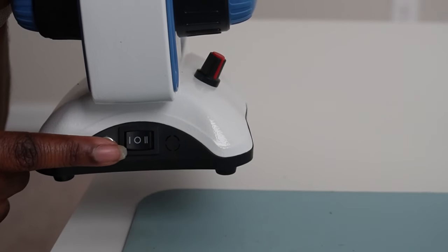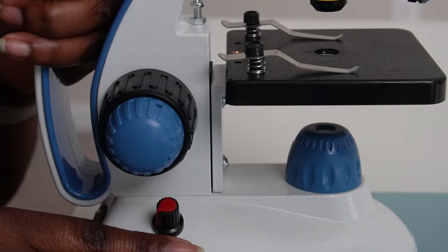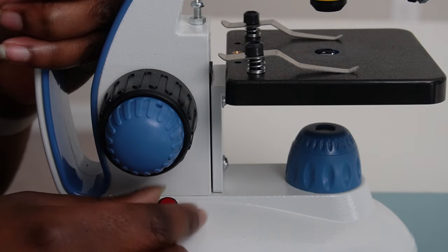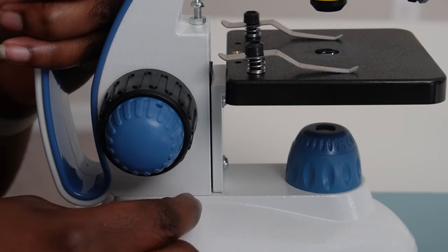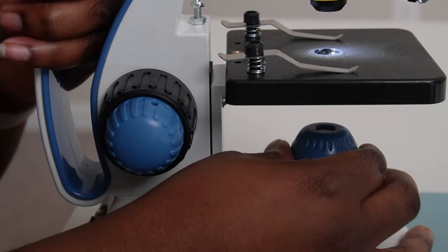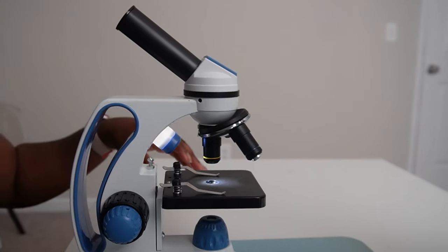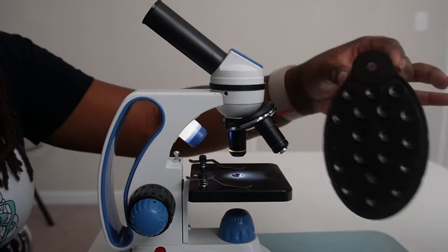There is a power switch located in the back of the microscope. Let's power it on and test it out. Okay, I think this would be the knob. Yeah, so this is the brightness adjustment. You can make it brighter or lighter.